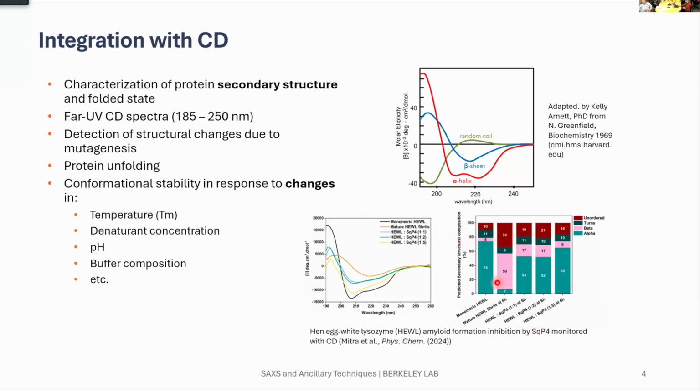In this panel, we see different secondary structures of that amyloid under the effect of inhibitors. At the very right, under high concentration of inhibitor, we see the formation of just the monomeric state of that lysozyme, similar to this one. So as you can see, just based on the effect of some small molecule, we can monitor those changes under different concentrations.